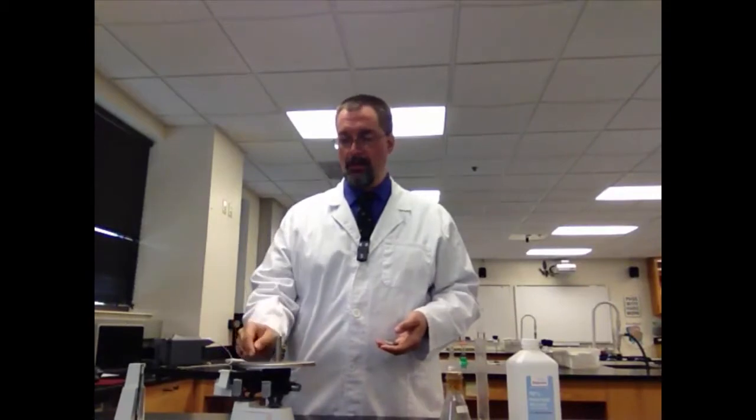The process is find the mass using the triple beam balance. You know how to do that. Put the cylinder on the balance, move the sliders until it balances, read carefully, making sure that you do that last digit estimation, and record your mass. You'll do the mass of all three pieces of metal.